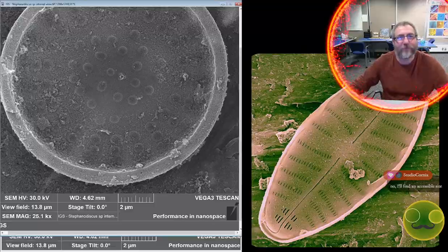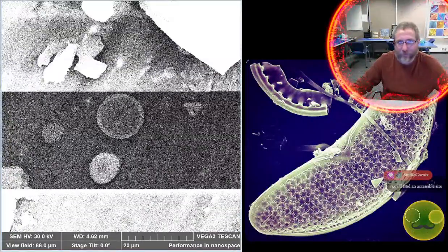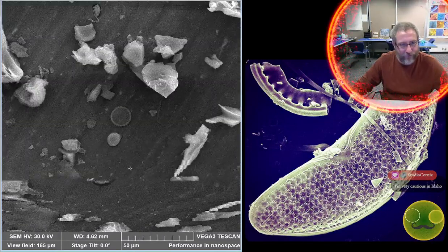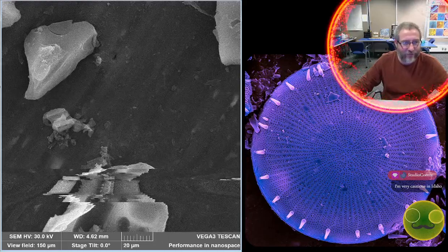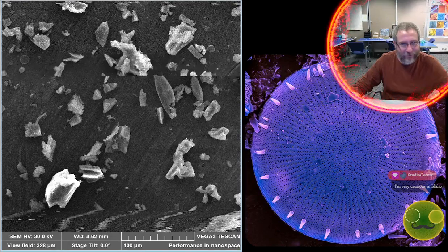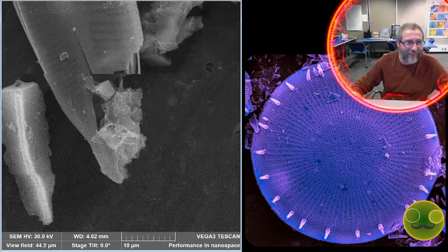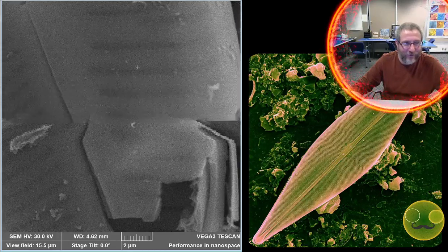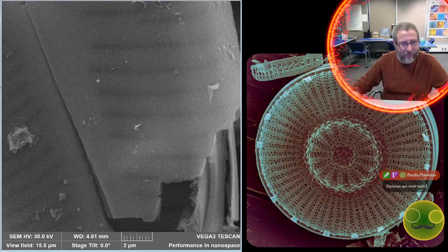Internal. So that's Steph. An internal view of a Stephanodiscus. There's a lot of other stuff in here. And I think this is a Cymbopleura. I'll have to wait until it's moved and then zoom in like a patient person would. I think this is a Cymbopleura. I would just want to see if it has crazy areolae or what's going on with the pores. I can't really see them. Oh, there's slits. They're just lineolae. That's not very exciting.